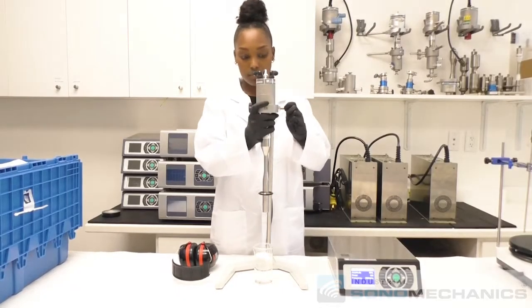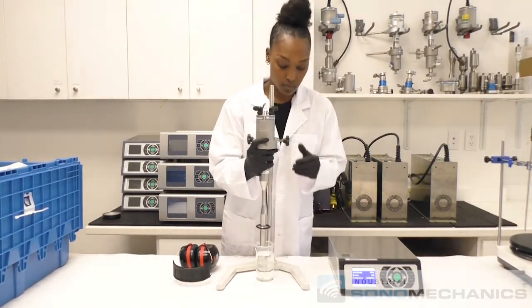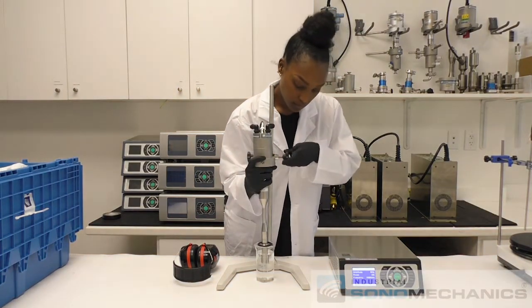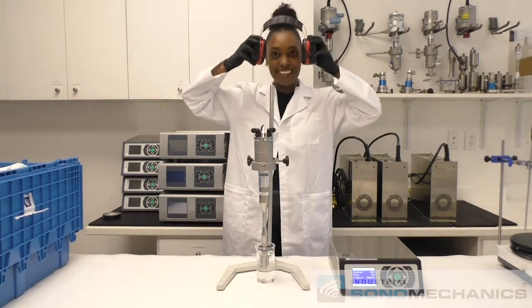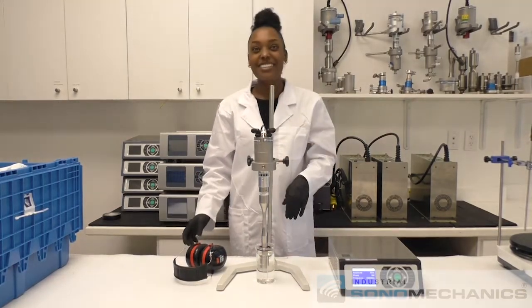Place a beaker with the liquid under processing beneath the ultrasonic stack. Lower the stack, submerging the barbell horn in the liquid by about 2 inches or 5 cm. Be aware of your hairstyle when placing the noise reduction earmuffs over your ears.